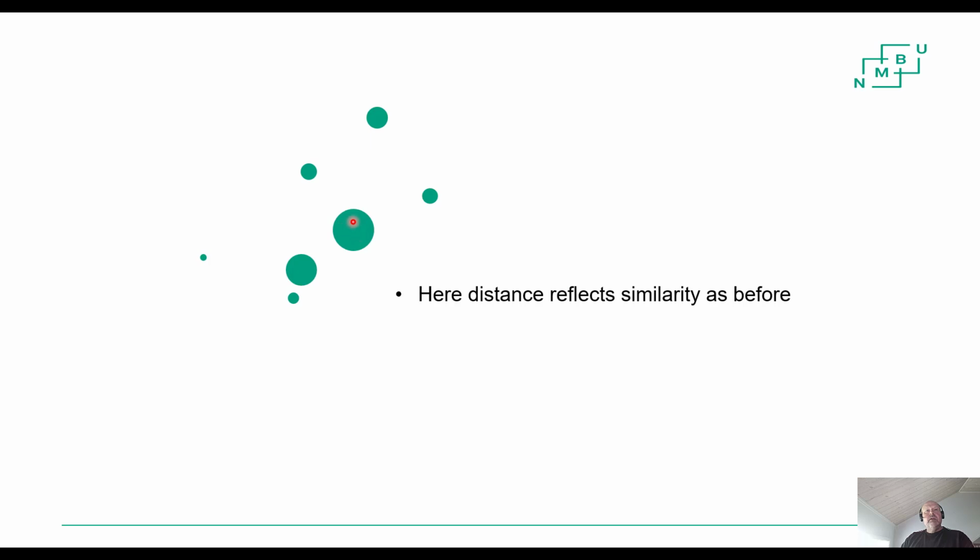So if we did this similarity clustering, we would start here at this one, the most abundant one, make a radius around it, and group everything that falls within that radius. Let me now show how this abundance p-value clustering will deviate. Because the abundance p-value doesn't only depend on how similar they are, it also depends on the abundance of these potential children. All these around the big one here are now potential children of this mother.